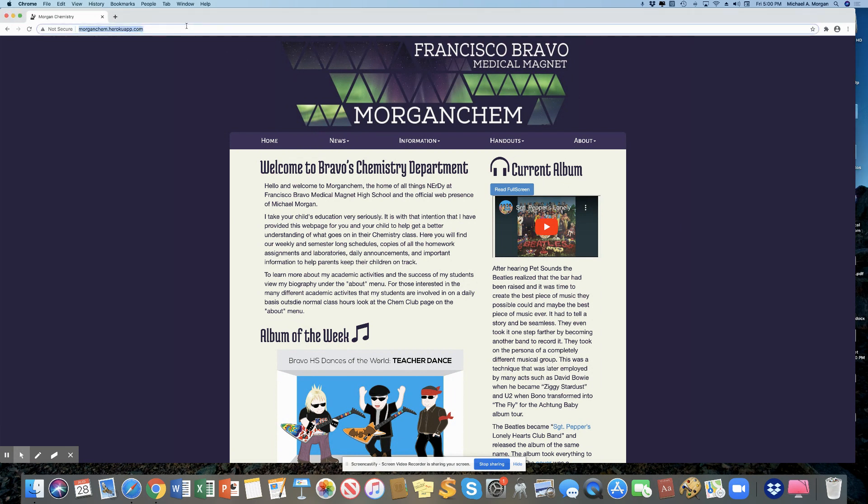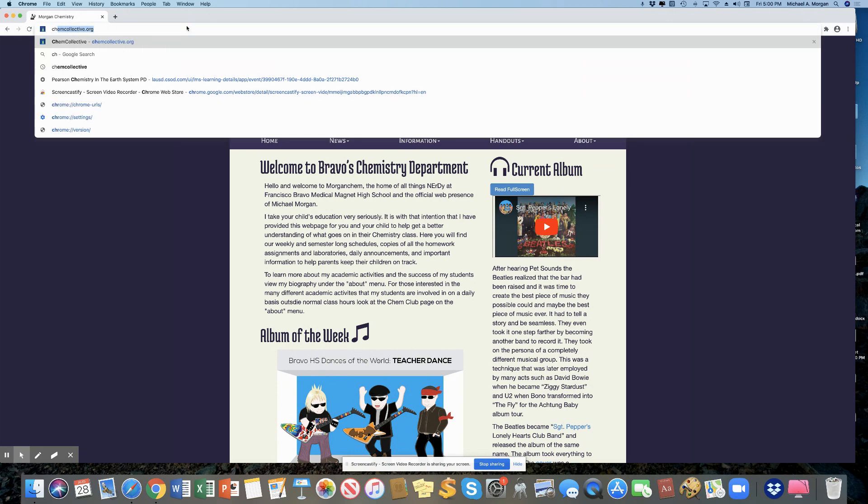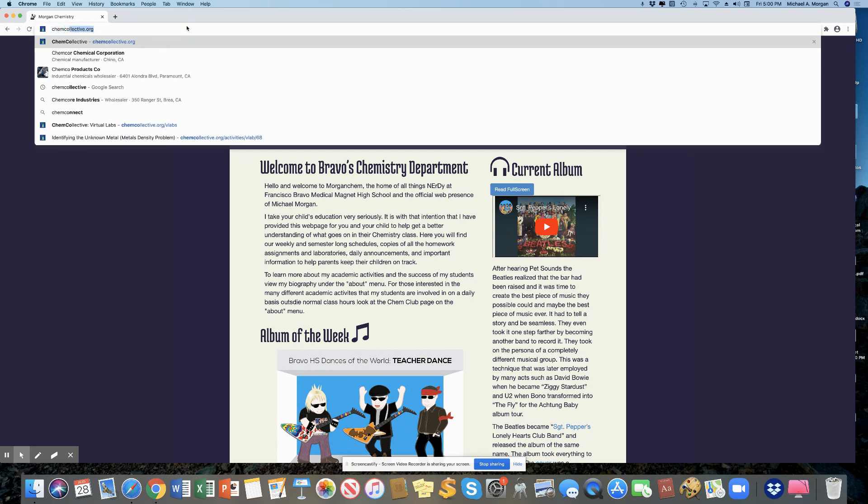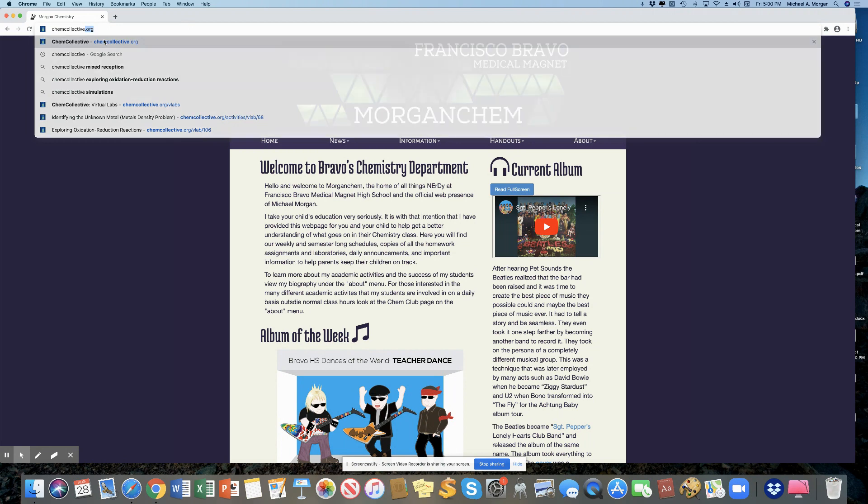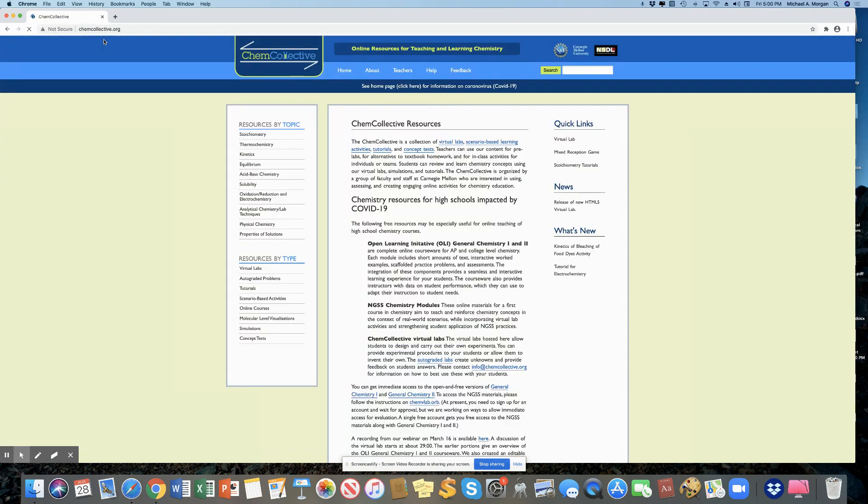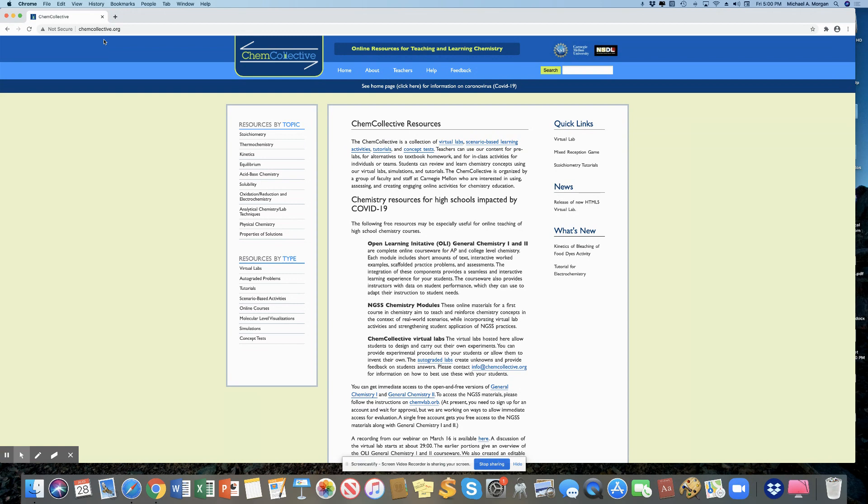So in a web browser, you want to go to chemcollective.org. You don't need to make any login or anything like that. It doesn't require any information to do this.